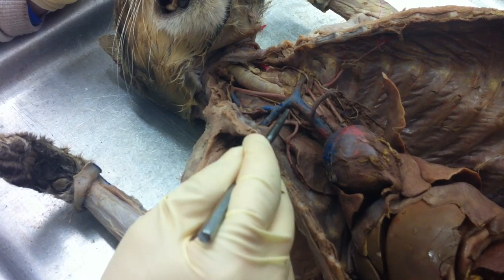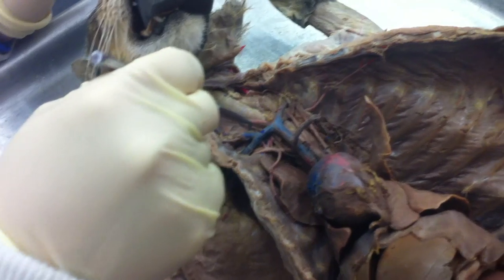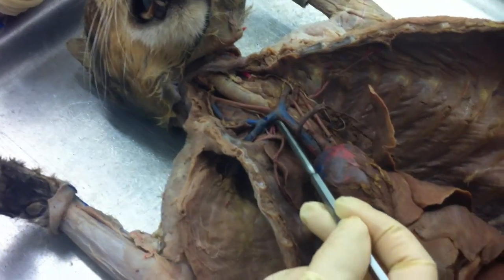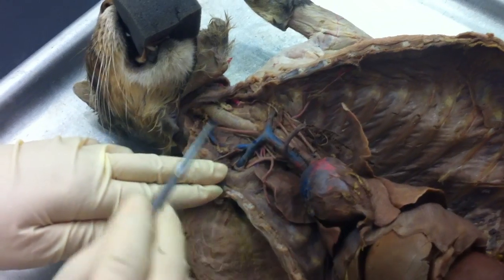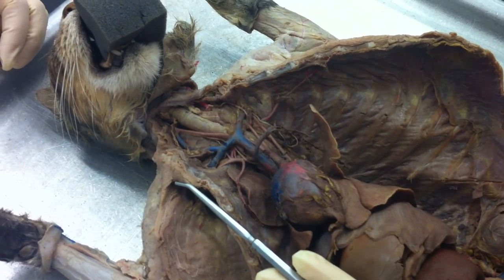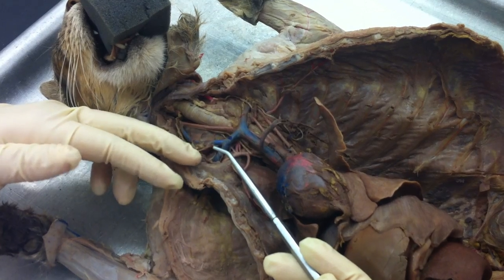This one is very short, or it appears short, because it goes right away deep to the cervical vertebrae. Vertebral. Right, and it's going to travel up that vertebral column. So this is the vertebral right here. Very short, but head's sort of north. Is that supplying blood to muscles in the back, or does it go everything up to the head? To the head? It isn't the main vessel that serves the head, but it's one of them.